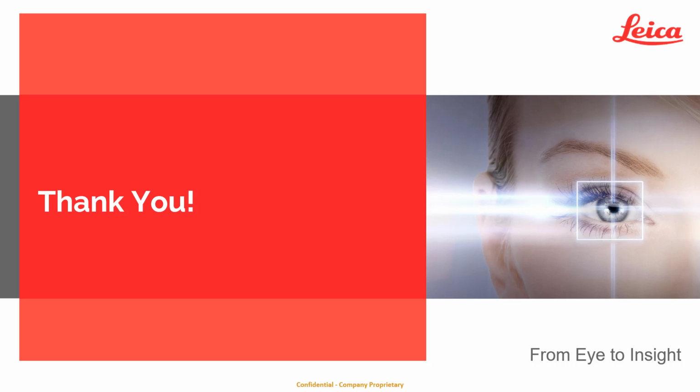I hope you will try it and benefit from the tremendous advances that we are introducing with 10.5, which we hope will truly accelerate the rate of discovery in the field of neurosciences. Thank you for your attention.